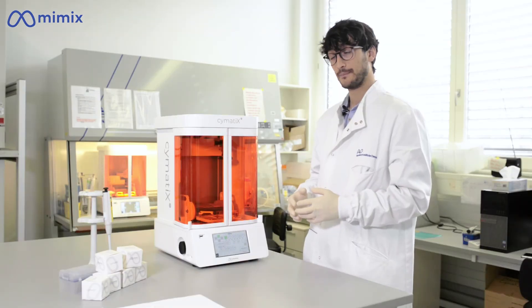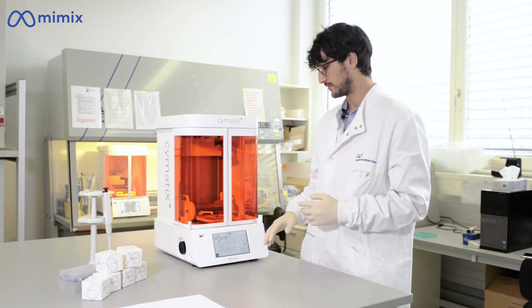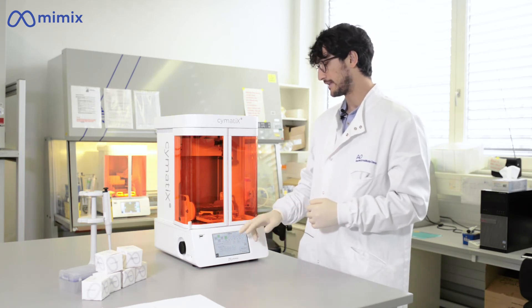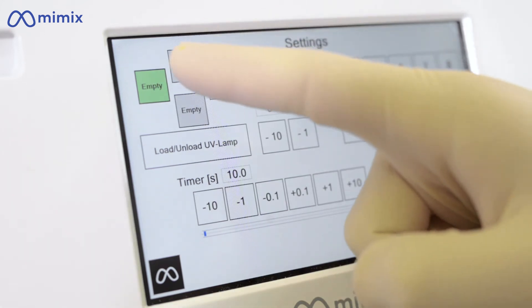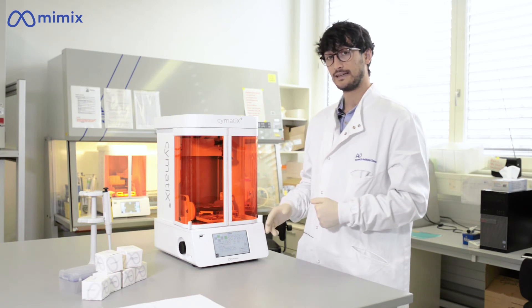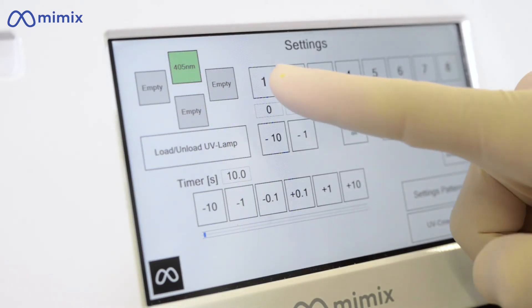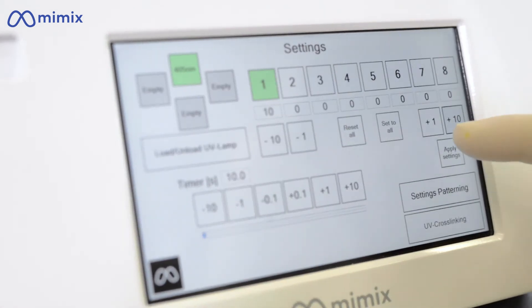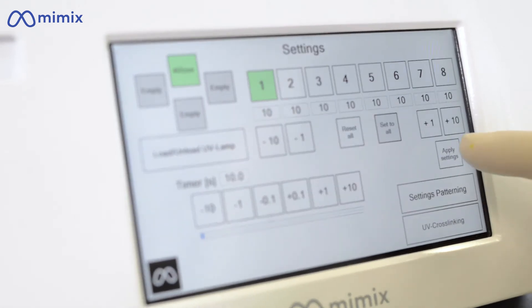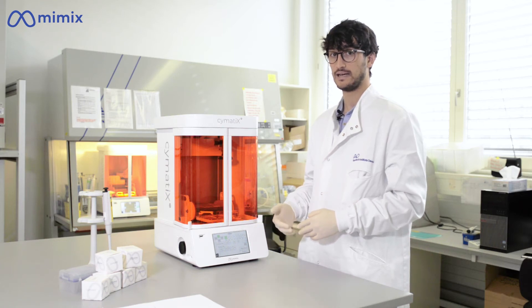As a next step, you will need to set up your UV crosslinking parameters. To do this, you access the UV settings interface and choose the wavelength of the light. At this point, you can select either a uniform intensity value or different values which can be set as a gradient on the illuminated surface. After you've done this, you apply the settings and proceed with the next step.